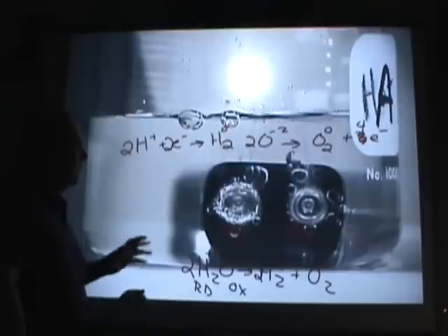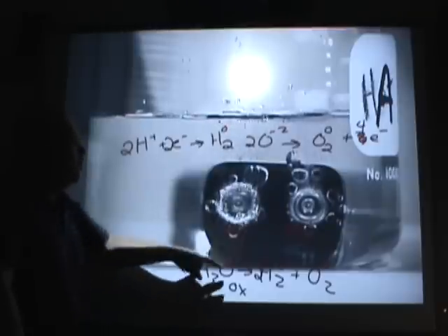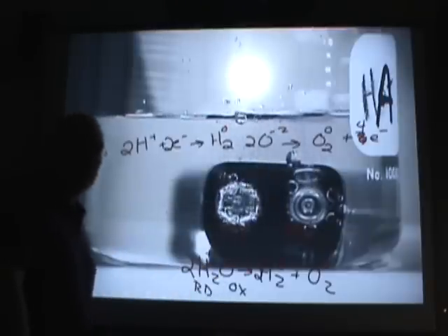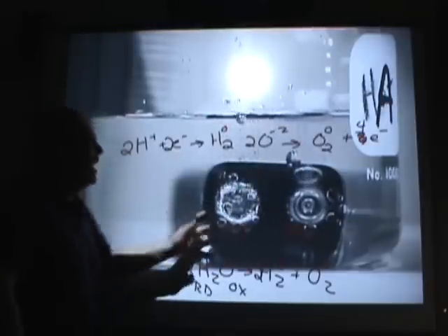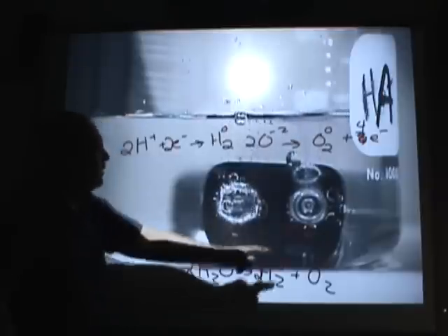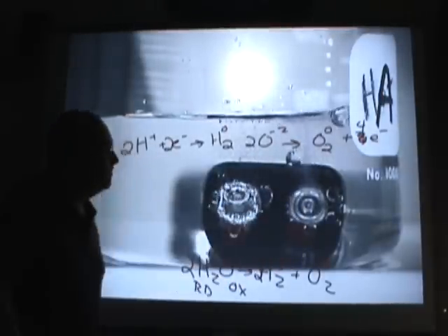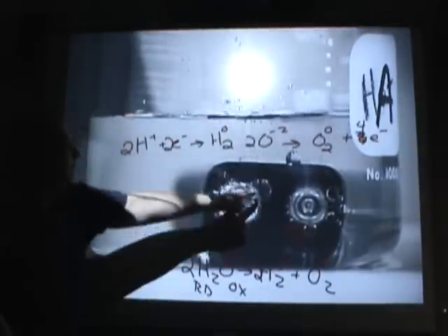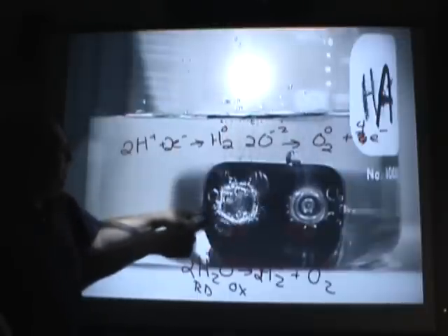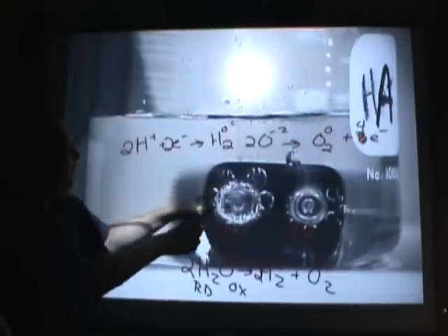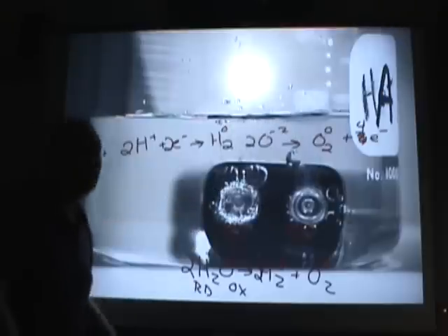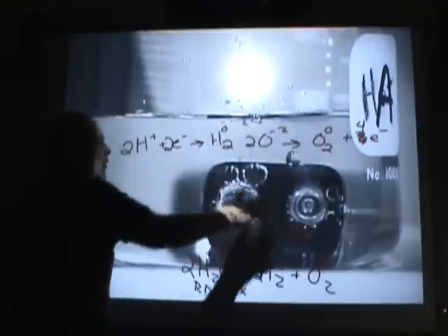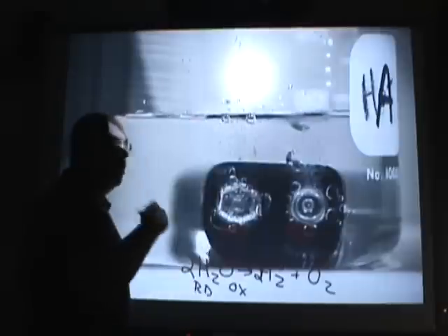Now, the formula is H2O. So we should expect to get double the amount of hydrogen as we're getting oxygen. If you take a look at the size of the bubbles coming off the hydrogen electrode, they're not such of a much. But look at the size of these monster bubbles coming off the hydrogen electrode. They're huge. Two to one ratio of hydrogen to oxygen.